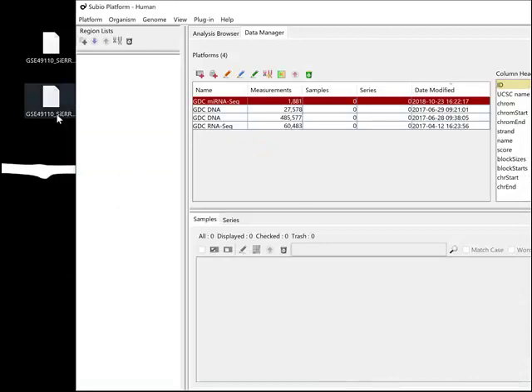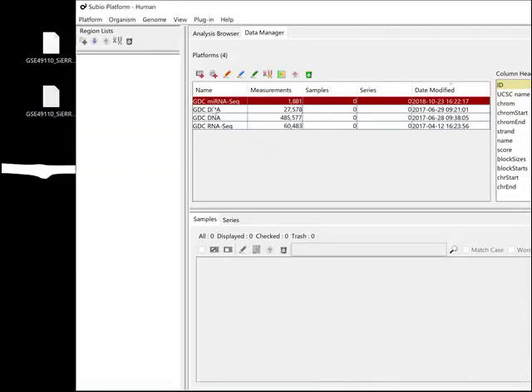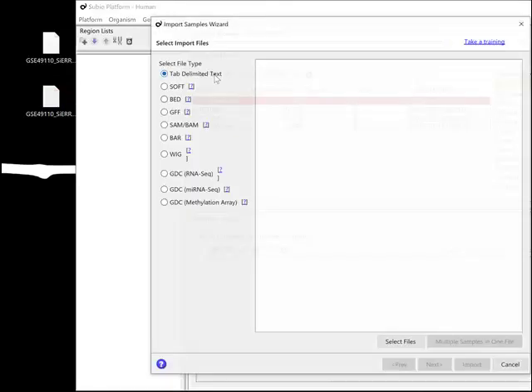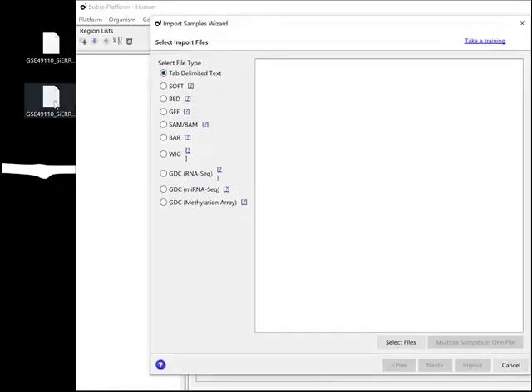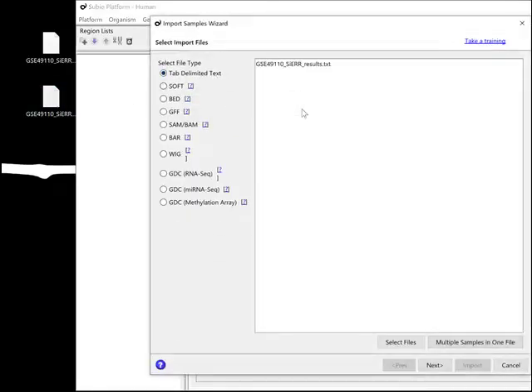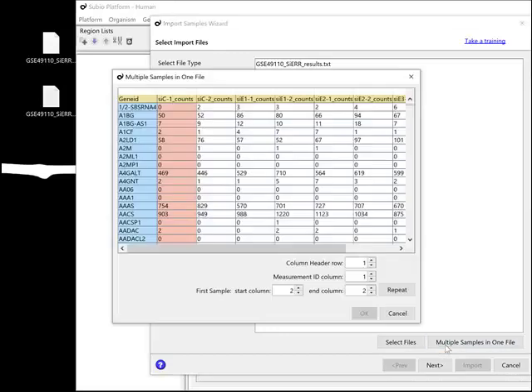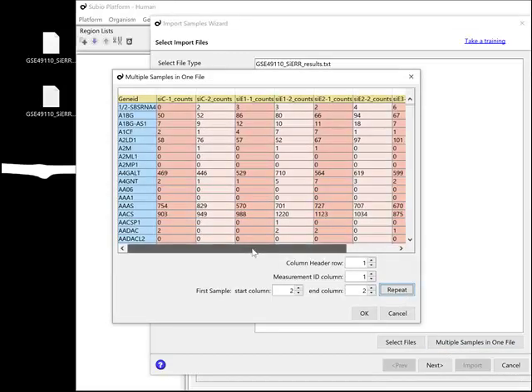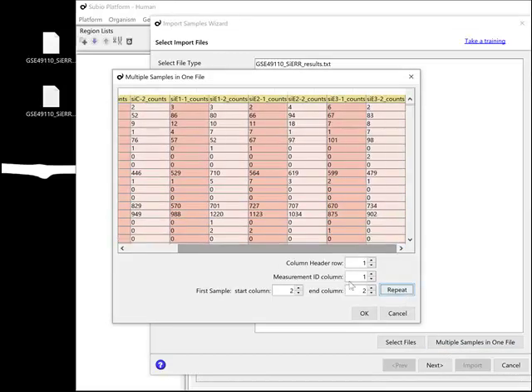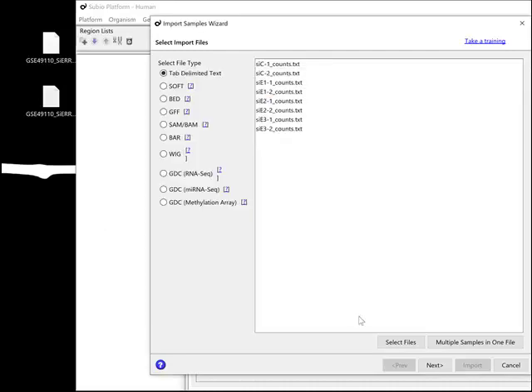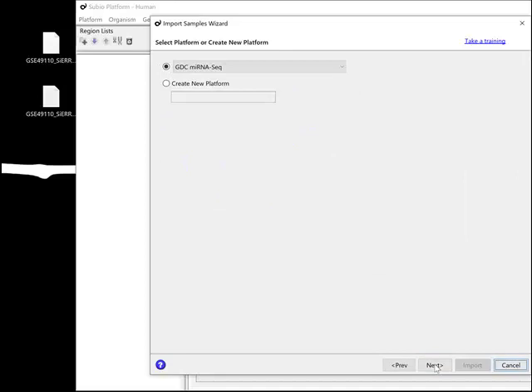Now import the table of counts as Subio platform samples. Use the option to extract individual samples. In this case, you don't have a corresponding platform for this data, so use the new platform option.